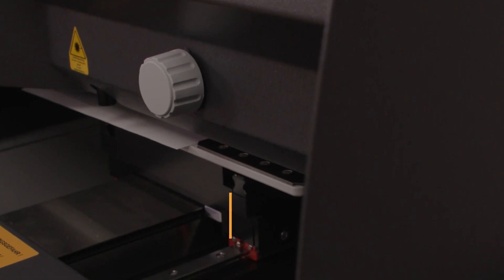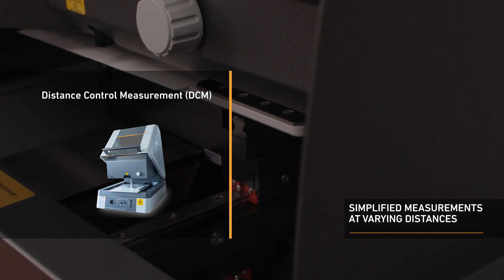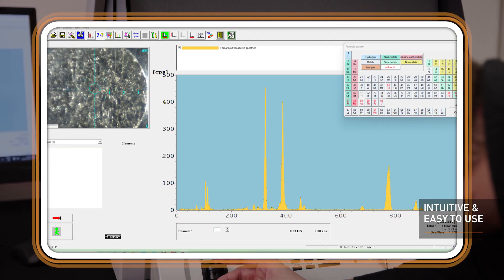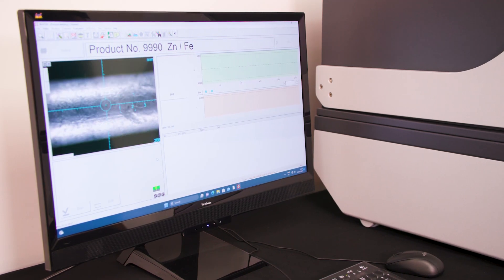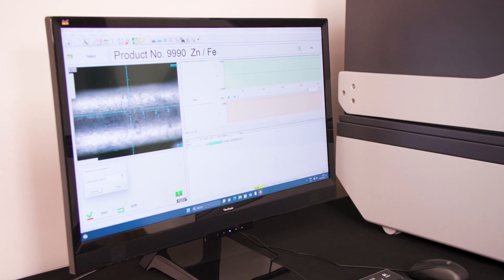The instrument possesses a patented distance control feature, enabling the measurement of hard-to-reach areas on samples. It has easy-to-use software, so FischerScope users can be up and running with their measurements quickly, regardless of experience. Clear measurement data is gathered and stored, enabling powerful reports laid out in a simple way.